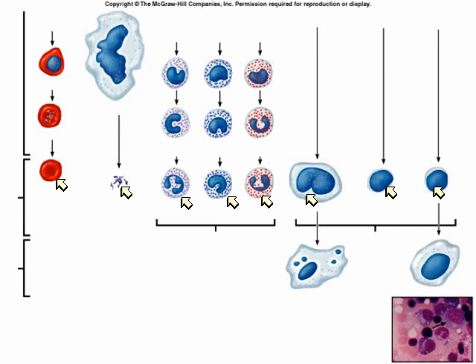If you were to look at a blood slide through the microscope, you would actually get tired of seeing neutrophils. They are so abundant as you're trying to count the different white blood cells. The lymphocytes are almost as abundant. They're a fourth to a third of all of the white blood cells. The monocytes are not nearly as abundant, 3 to 9%. Eosinophils are only 1 to 3%.